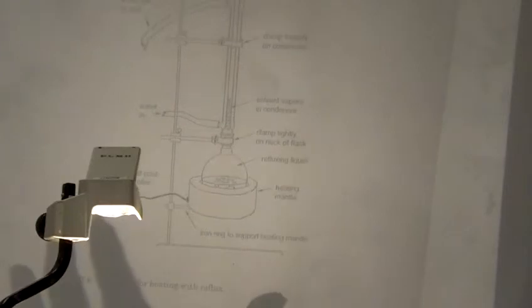You're going to have your heating mantle that, remember, is connected to the Ohmite. Remember that special plug on your hood with the switch. That's where the heating mantle goes. It does not go in the regular wall outlet that's on your hood, okay? So be really careful that it goes in the right spot. If you put it in the wall outlet, it's going to heat really fast and get your reaction way too hot, okay? So make sure you put it in the right place.